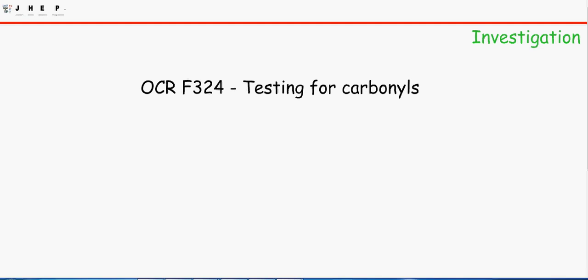Hello and welcome to J-HEP session on testing for carbonyls. This is an investigation lesson so it'll be good if we just go through the whole video and not skip between sections.